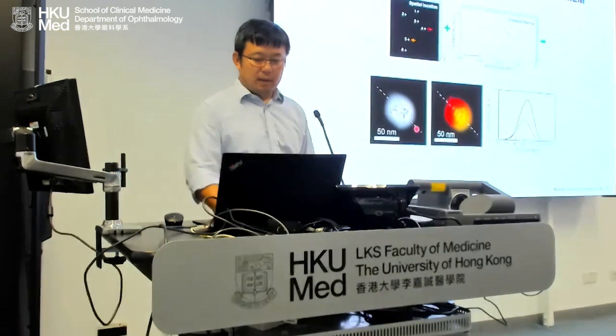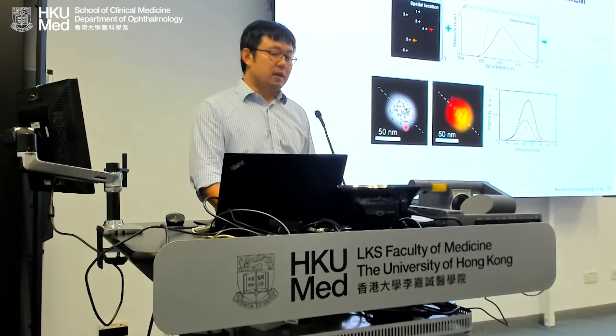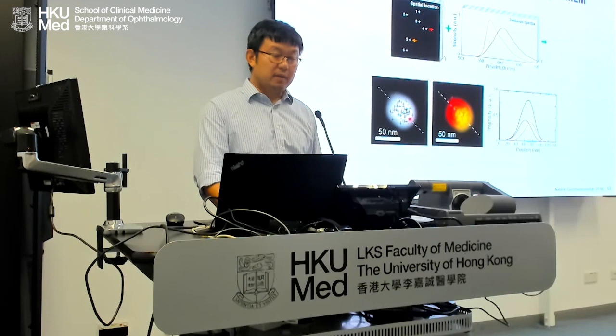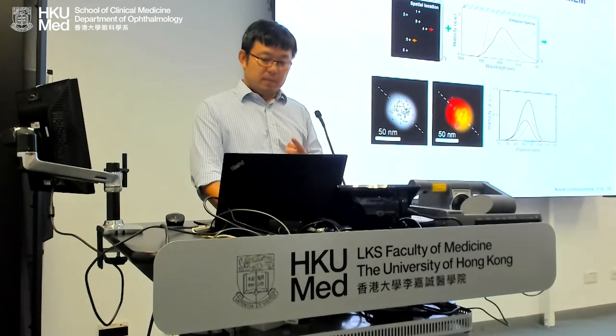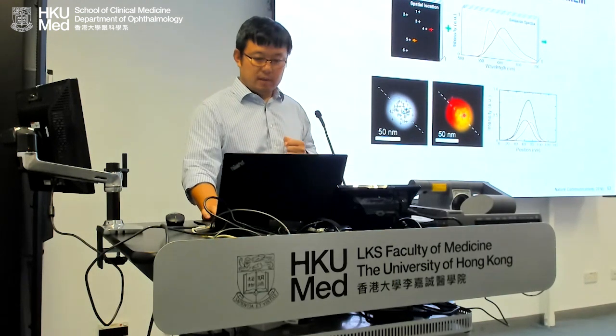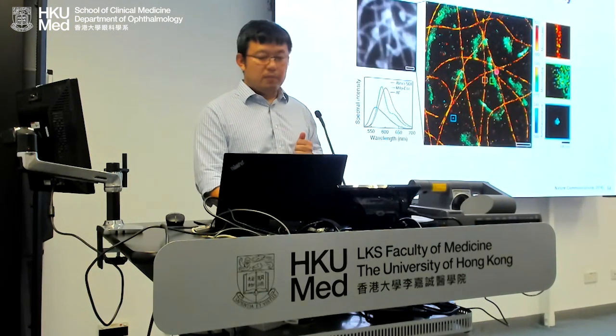they are. This one shows that if we don't have the spectral information, people may believe this is a single molecule. But based on spectrums, there are actually 2, just very close to each other. And this is a cell image.